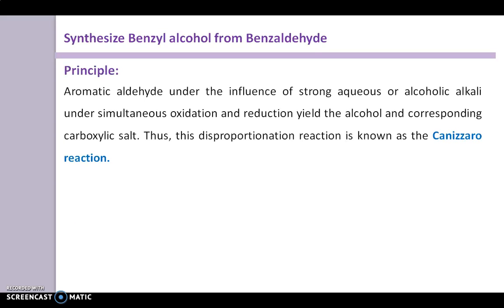The aromatic aldehyde, under the influence of strong aqueous or alcoholic alkali, undergoes simultaneous oxidation and reduction, yielding the alcohol and the corresponding carboxylic salt. Thus, this disproportionation reaction is known as the Cannizzaro's reaction. So remember, the synthesis of benzyl alcohol from benzaldehyde involves Cannizzaro's reaction.